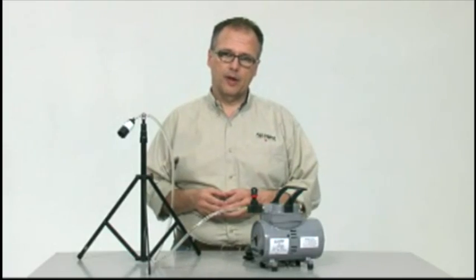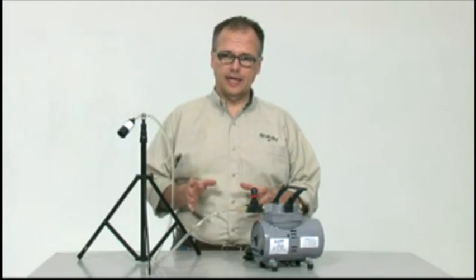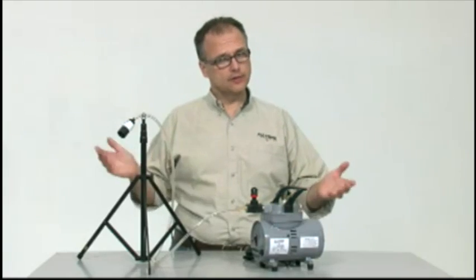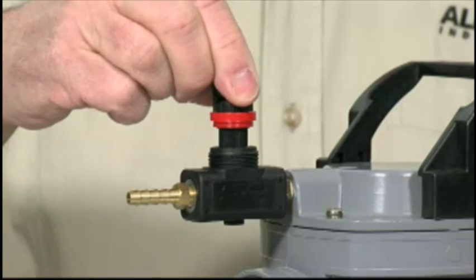The diaphragm sampling pump is available with or without a stand and tests for asbestos, lead, mold, dust and other toxins. This pump is quiet, economical and also has an adjustable regulator.